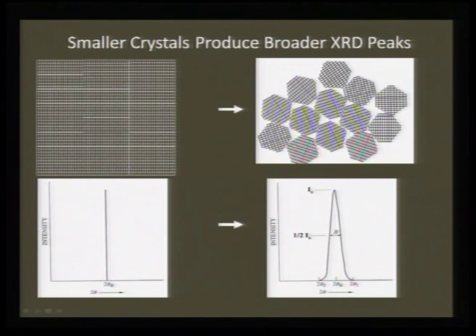Now if you go for single crystal or polycrystals, this is how it is. If it is an ordered lattice like this, then I would get a very sharp pattern, as sharp as this, and this is for a highly oriented system. So, the peak width or the crystallinity of a particular pattern will be reflected by the shape and size of the X-ray peak.